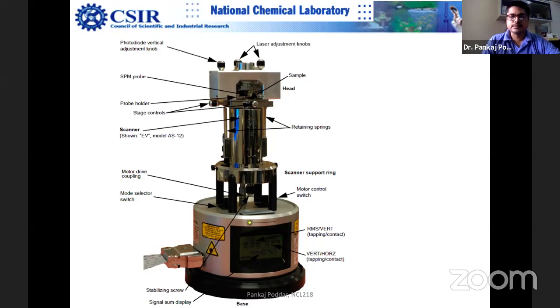So another point is thermal stability, because all the electronics, the parameters are highly sensitive to temperature fluctuation. For example, you have put the AC on 25, and your outside temperature is around 40 or 35 degrees. So it takes time to thermalize the room, and then it takes more time to thermalize all the ICs. Believe me, your room temperature may come to 25 within half an hour, but inside, all the components, because heat is generated, it may take several hours for the ICs to get stabilized. Finally, at the component level, it takes a lot of time, because everything has got heat insulation and its own heat generation also. And these electrical parameters of ICs depend heavily on the temperature.